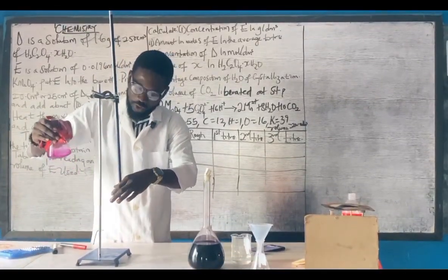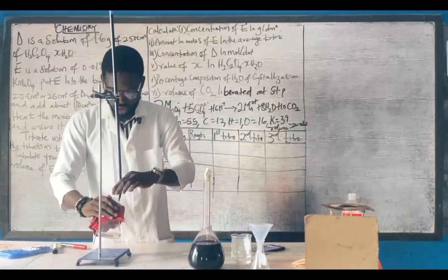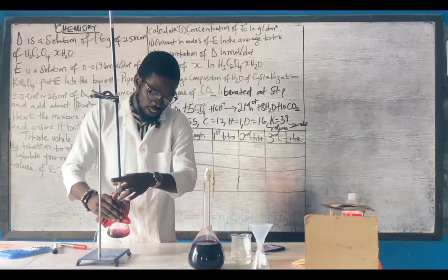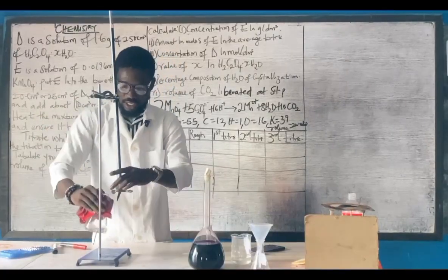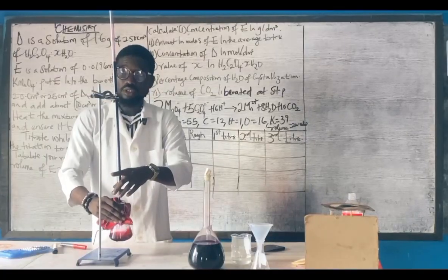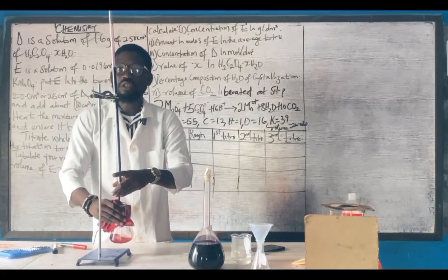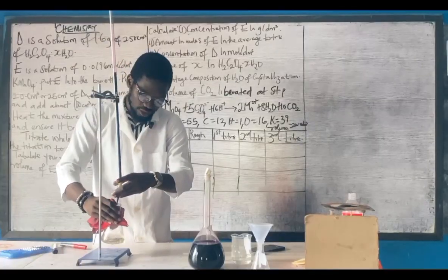So when you see the first coloration, are you seeing it now? It's a change of color. So we continue. Our main objective is to attain a pink coloration. You can see, not there yet. When you are doing it, you need to be very, very careful. Our coloration must be pink.